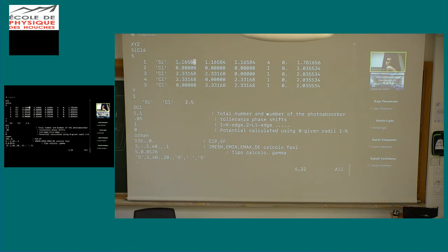So in this case, okay, we already have the various coordinates. In this case, they are centered around this chlorine atom. So this is a translation, but you can also use different translation. It's not important. You can also use negative coordinates. It's not a problem.